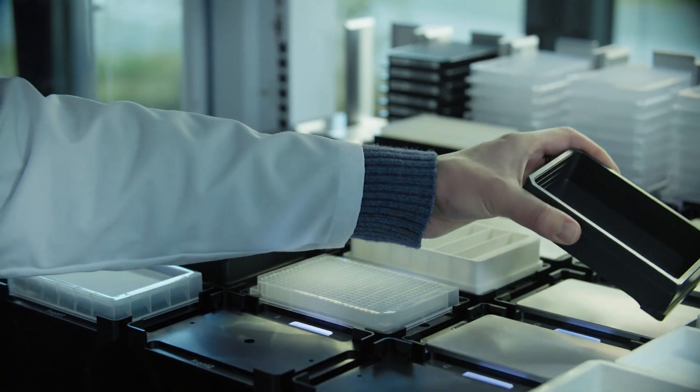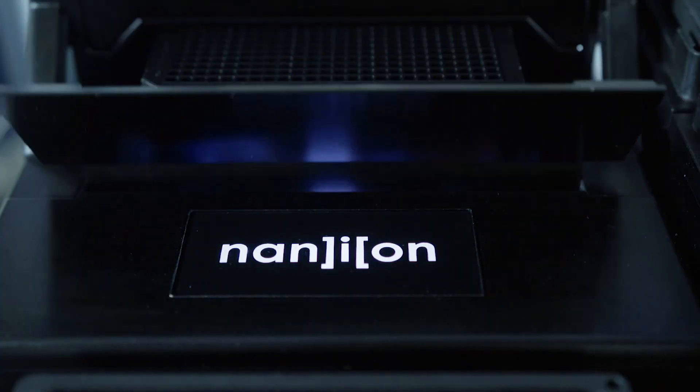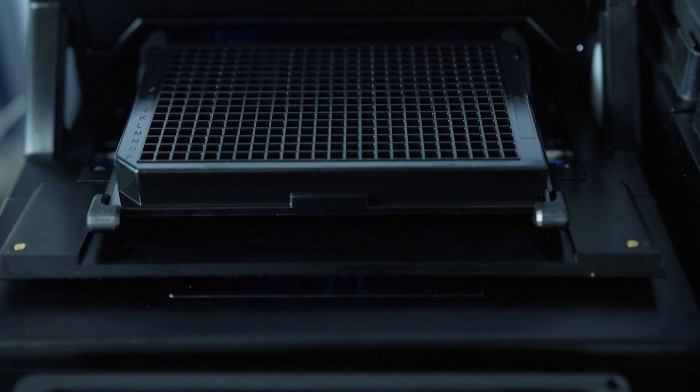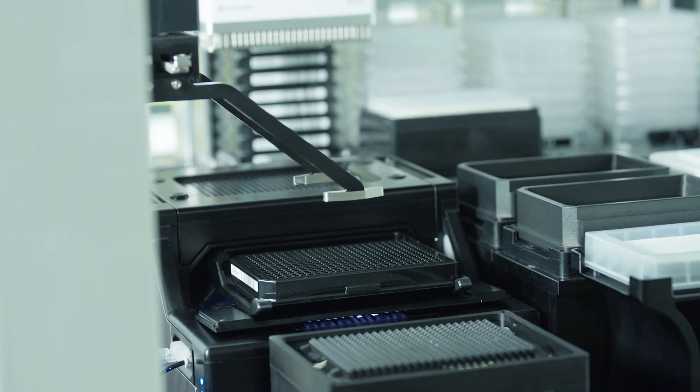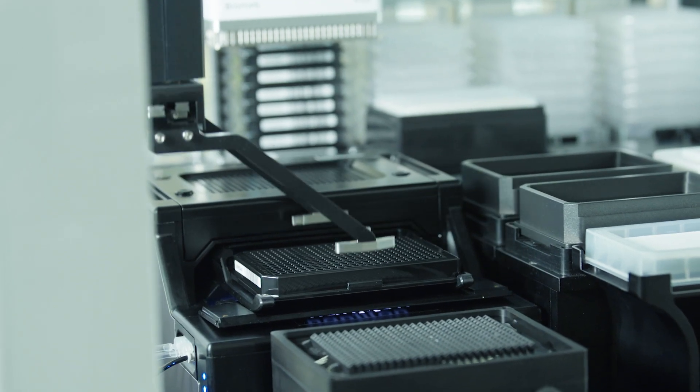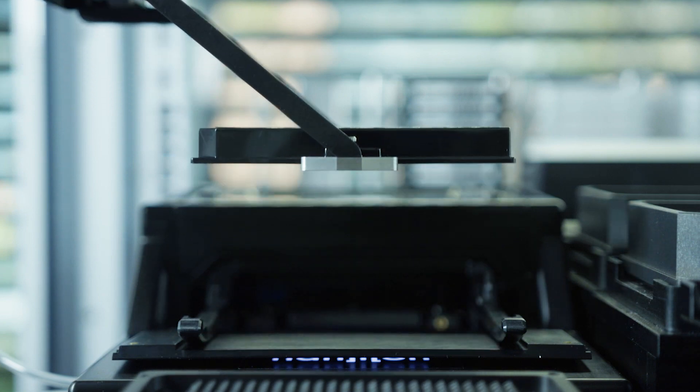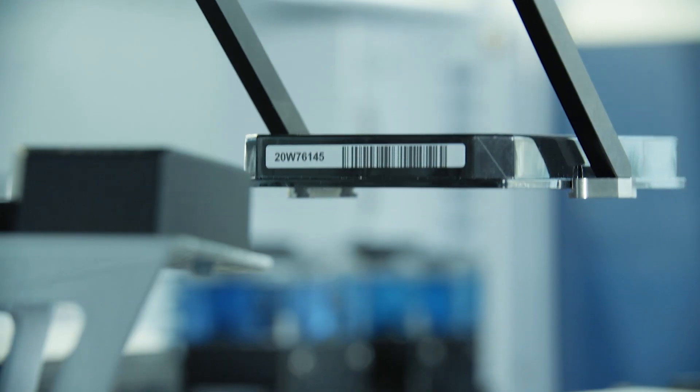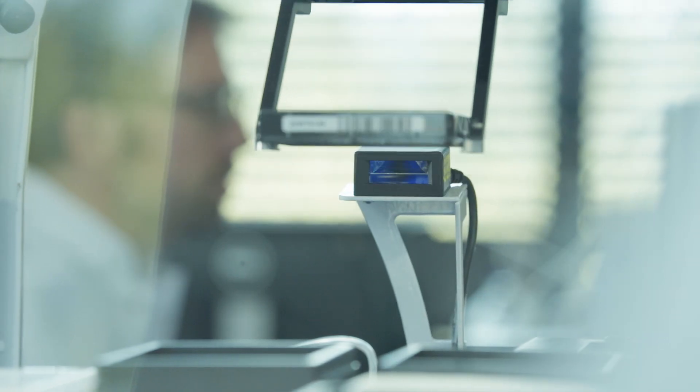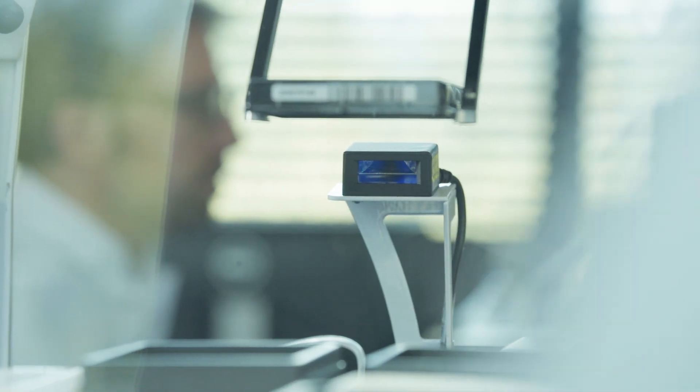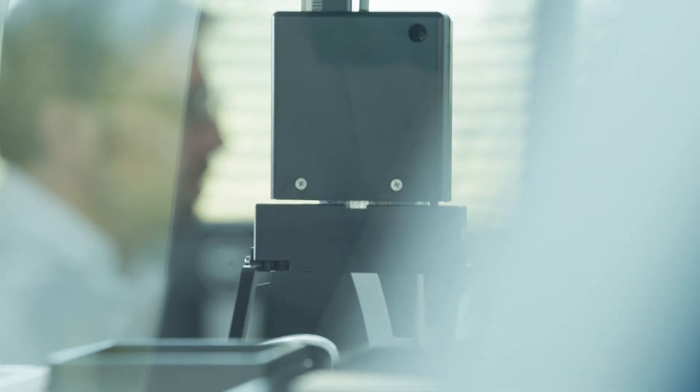The Syncopatch 384 is our newest generation automated patch clamp system. Whether you're screening large compound libraries or investigating complex biophysical properties of ion channels, the new Syncopatch 384 can do it all due to its high flexibility.